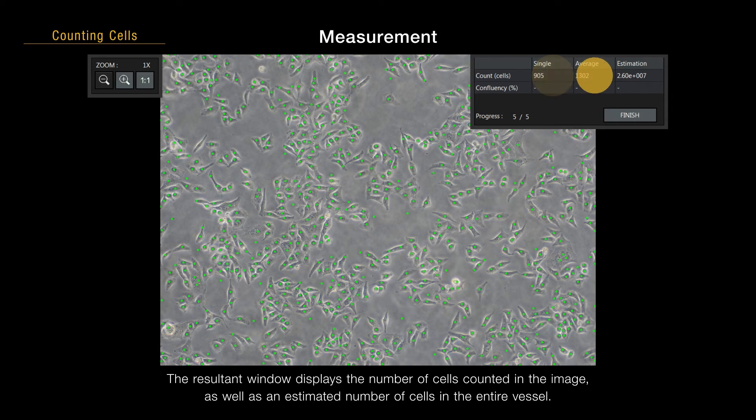The resultant window displays the number of cells counted in the image, as well as an estimated number of cells in the entire vessel.